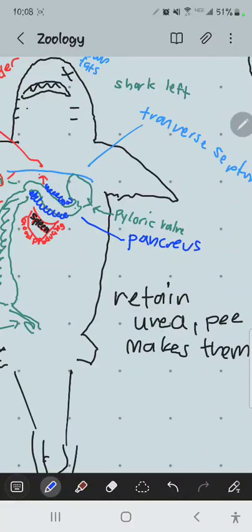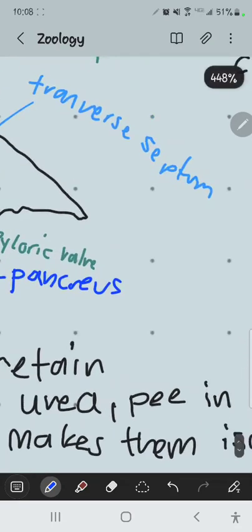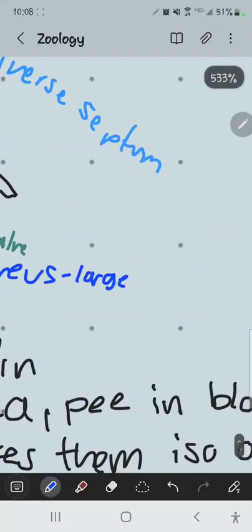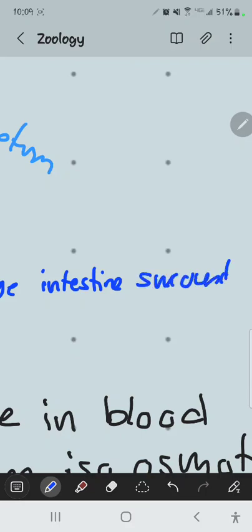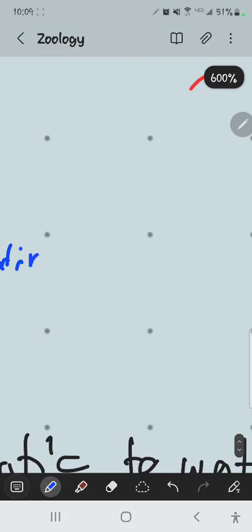And now you can get an idea of why it's so difficult. If you have pancreatic cancer, get rid of it. It's so hard because the pancreas is not a defined organ. It's a big gland that surrounds your intestine. So take a look at that. It looks like bubblegum wrapped around the body. This is the pancreas. It's a glandular, gum-like structure wrapped around the body.